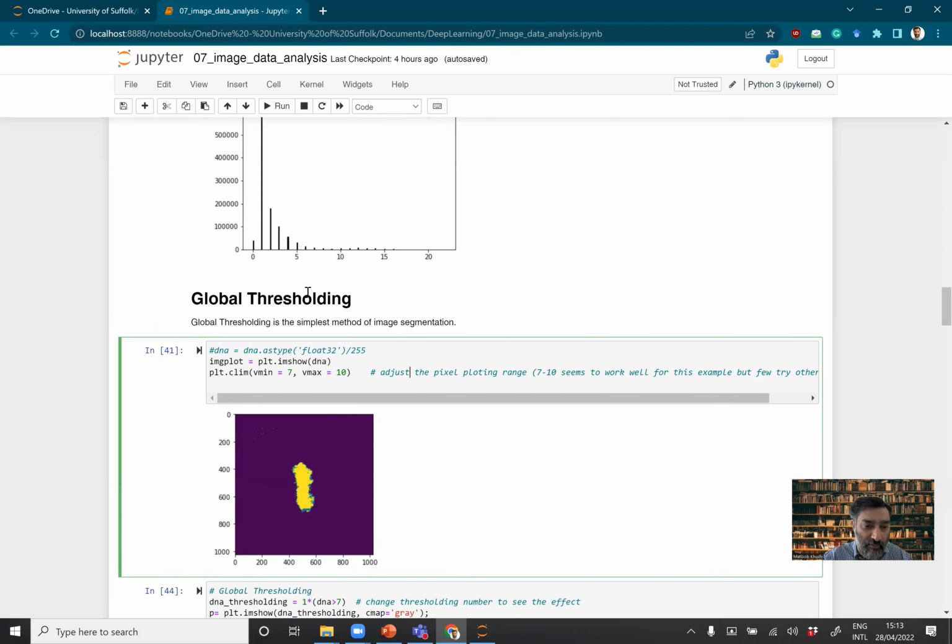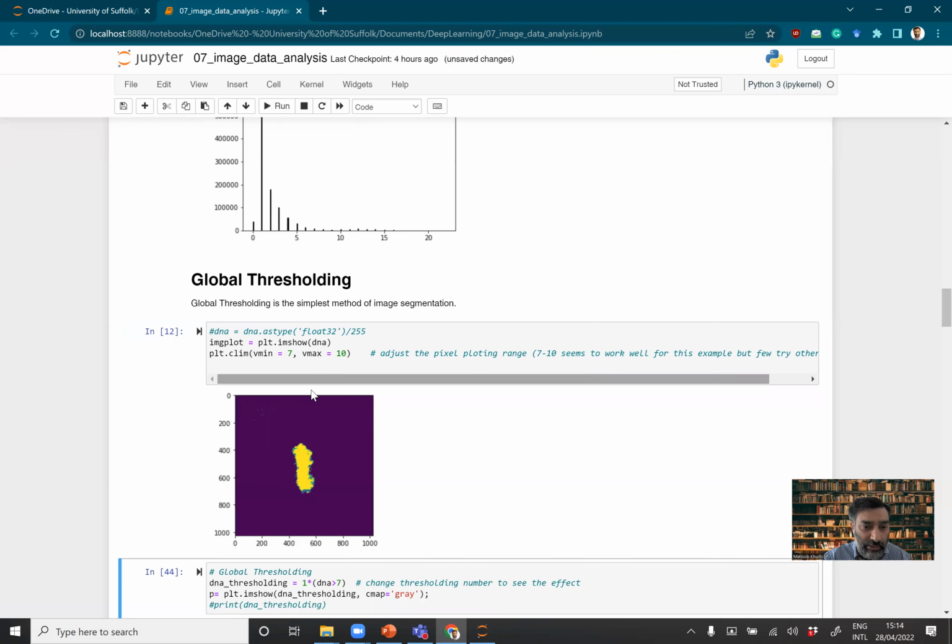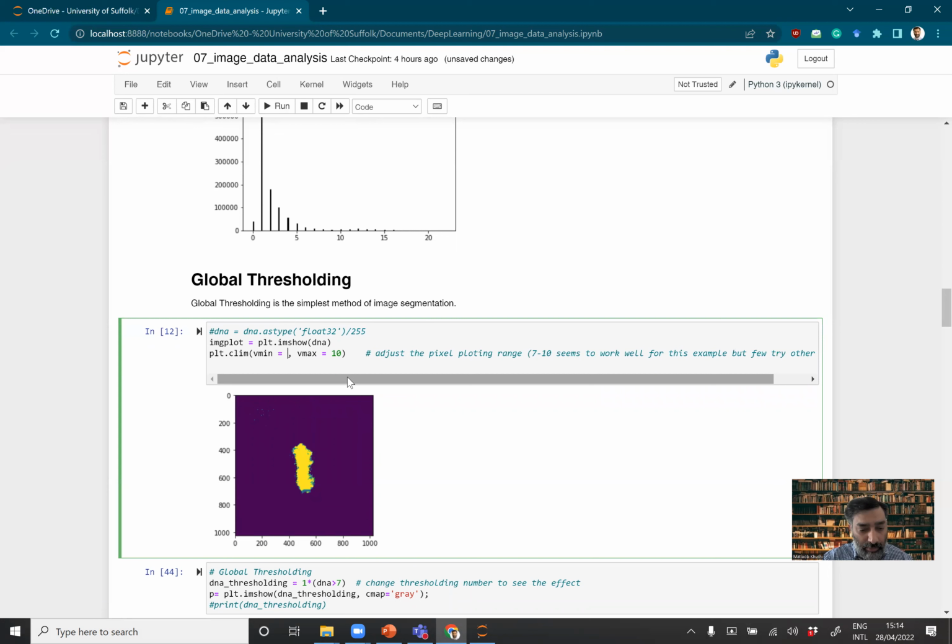And we can confirm that with this plot's color limits, by applying different color limits. We run it. For example, we define vmin, our minimum color limit. I could put 2 here, or maybe let's put 10 here. And for the max one, let's put 20 here.